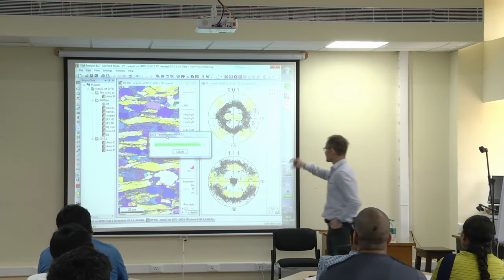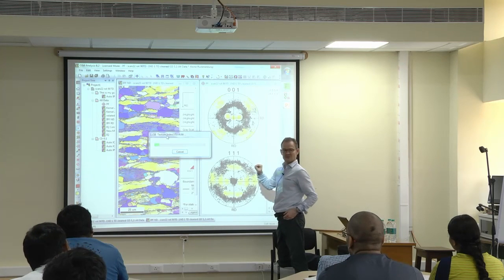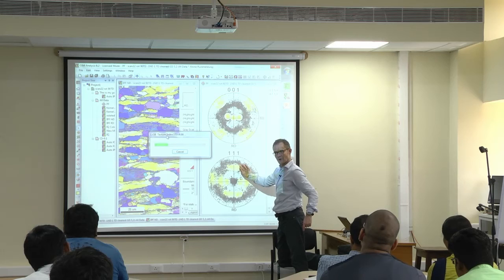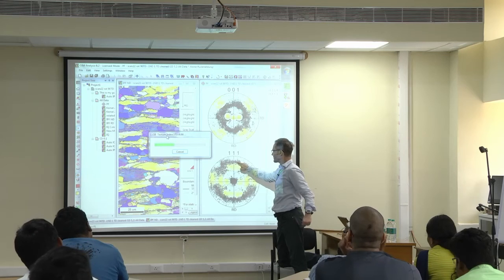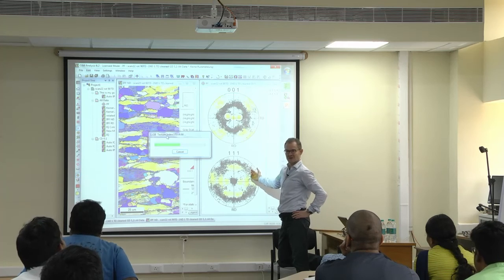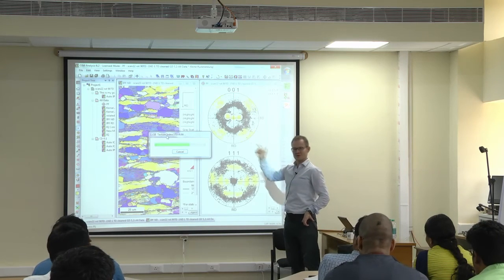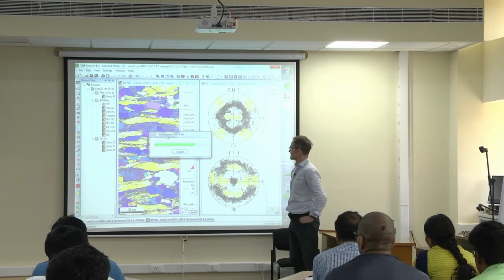What you can also do, maybe while this is calculating, a quicker way is so-called discrete binning. In this case, the software does the following. It makes little bins, that means little areas of equal size, and it just calculates how many points are in these areas. It doesn't calculate a function, but it just calculates a distribution of densities. So at the end, it can also display densities, but it has not internally calculated all the harmonic series. It depends on what you want to do. Sometimes these C coefficients can be quite powerful. I'm not going to talk about that.